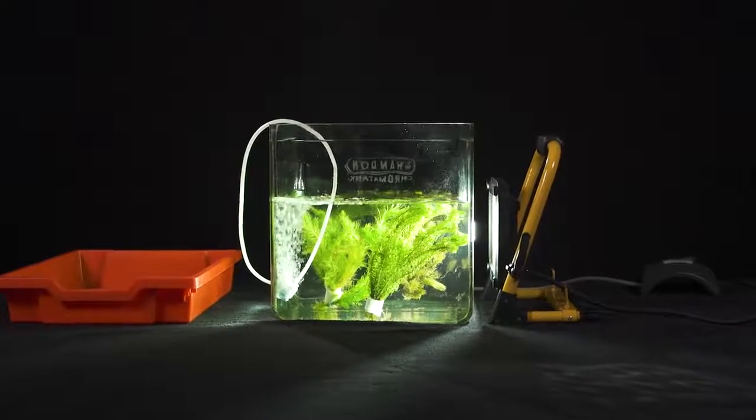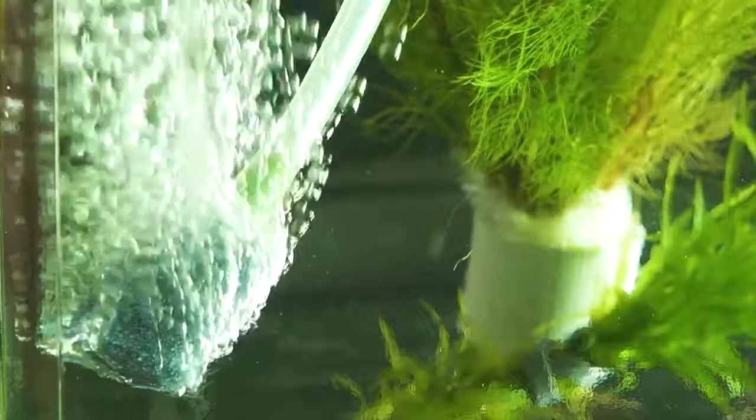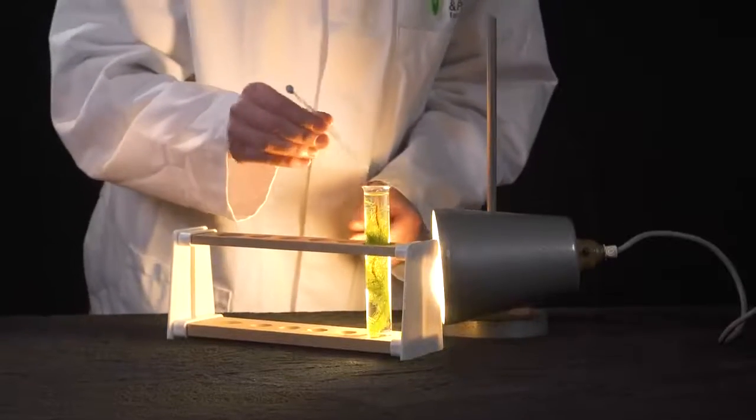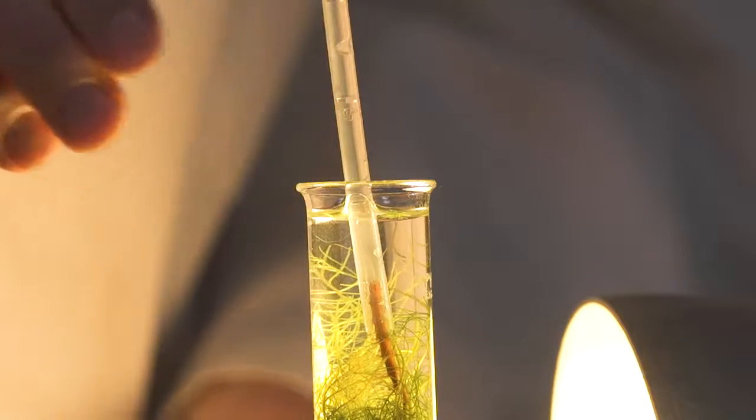Pondweed is a living organism which responds to its environment, so it's important that the pondweed is kept in conditions that mean it's photosynthesising readily before as well as during the practical. Pondweed should be in a brightly lit, aerated tank at room temperature well before the practical starts. This means that it is already photosynthesising when it is removed from the tank and placed in the experimental setup.